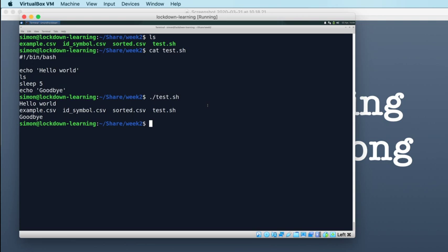Variables in Bash are defined in a very particular way. We use a very particular syntax to define our variable, and a very particular syntax to retrieve those variables later. So I'm going to write a little program that shows you an example of variables in action. First thing I'm going to do is highlight the hash character, so I've got it in my paste buffer.